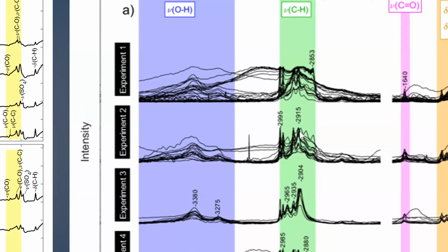But we do have the occasional problem of a particle that has a fluorescent background, or something that is going to really be kind of a challenge. You can see that particularly here in this last experiment, we added some biological material to the sample, and you can see that we really started to have a large background issue.